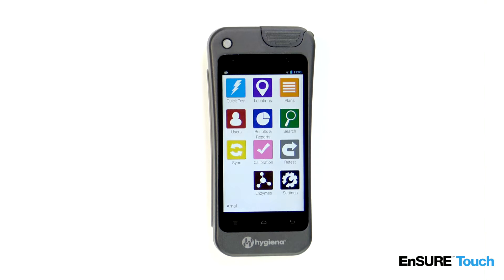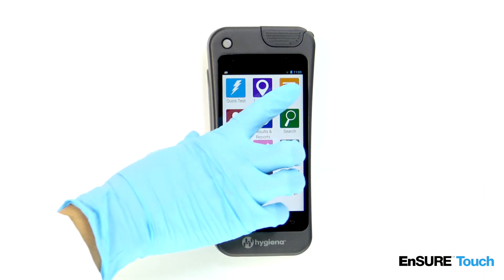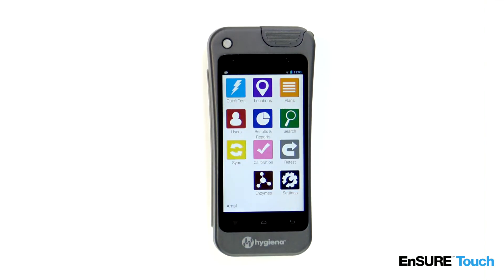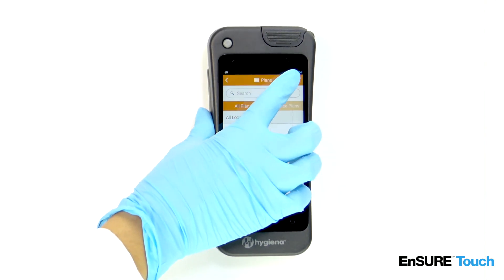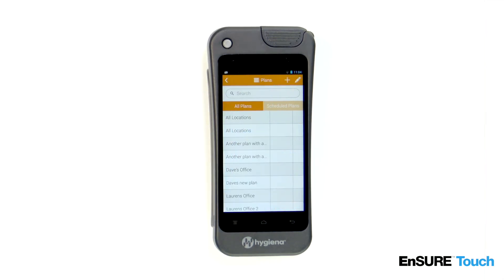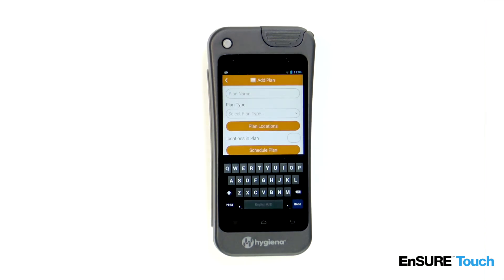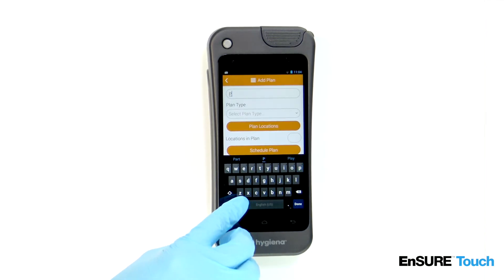To add a plan, touch the plan icon. Touch the add symbol. Enter the plan name.